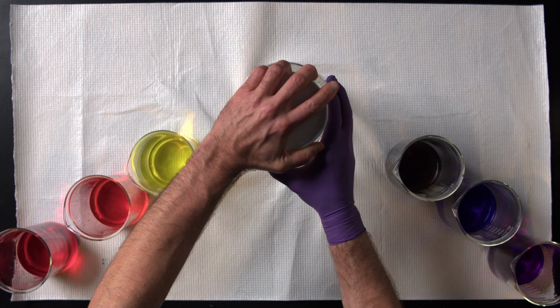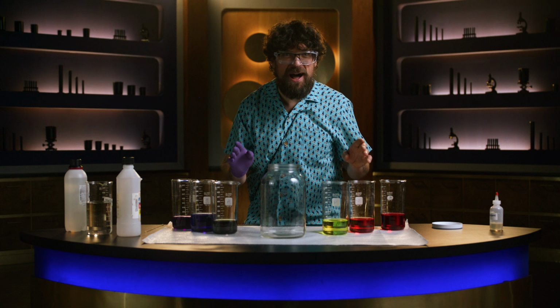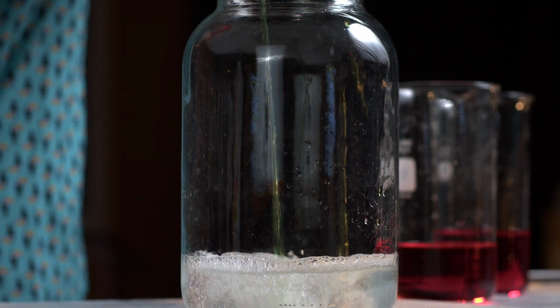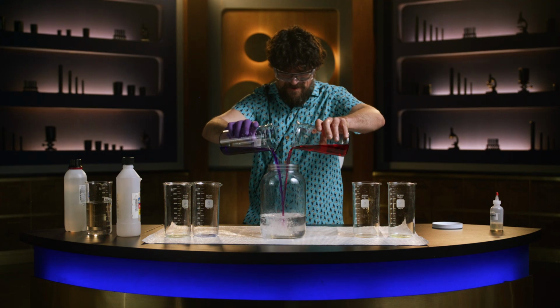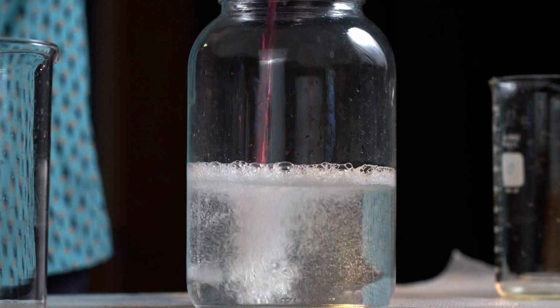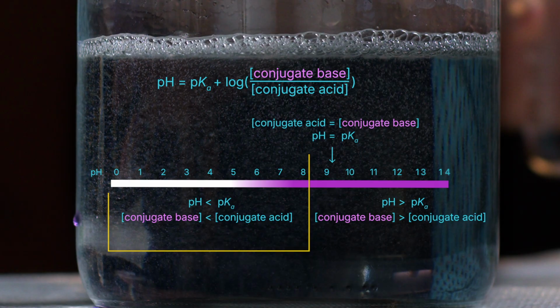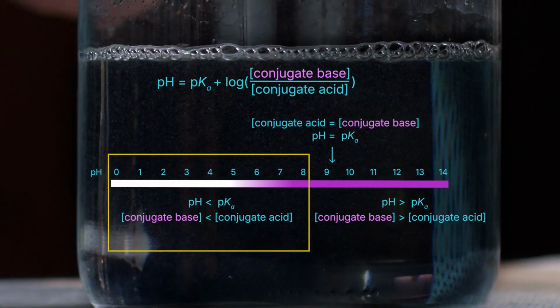Let's find out. This jar contains an acid that's about to steal the spotlight. The acid reintroduces protons, putting the molecules back in their protonated, colorless form.